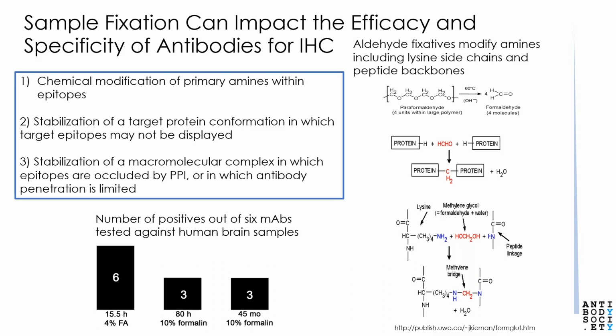The fixation reaction can directly occlude antibody binding to its epitope by chemically modifying these sites in the epitope itself. The reaction can also indirectly interfere with antibody access to its epitope by stabilizing biological or fixation-induced protein-protein interactions or specific protein conformations that are then not recognized by the antibody. Fixation can also generate protein-dense subcellular compartments or even entire tissue sections in which antibody penetration is impeded.